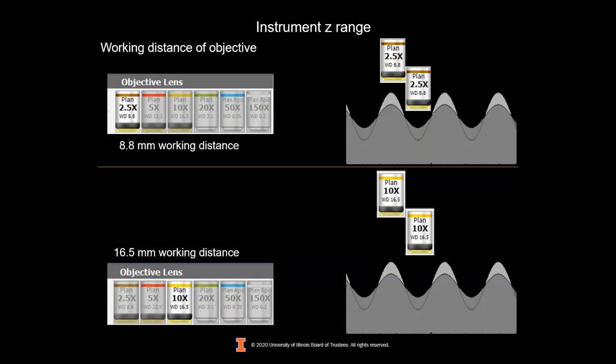If you have an extremely thick, transparent sample, that might actually help compared to a thin, transparent sample, because the software will sort of give up before it sees the substrate underneath. Although hopefully it will give up before it rams the objective into the sample.